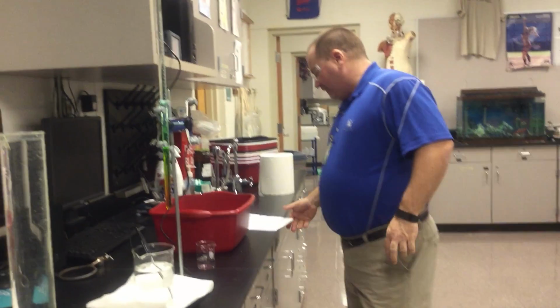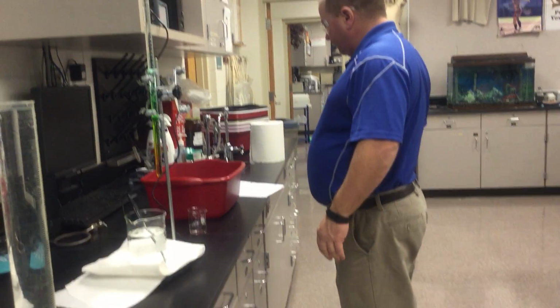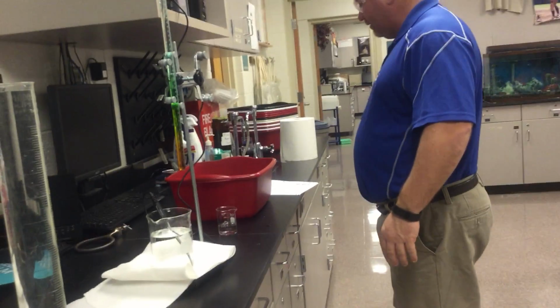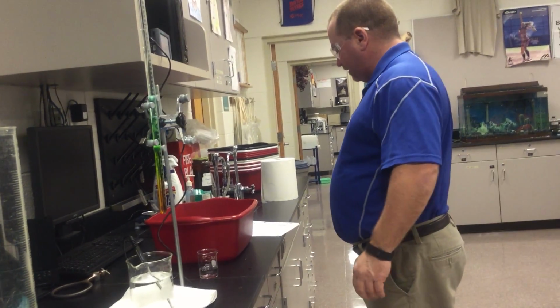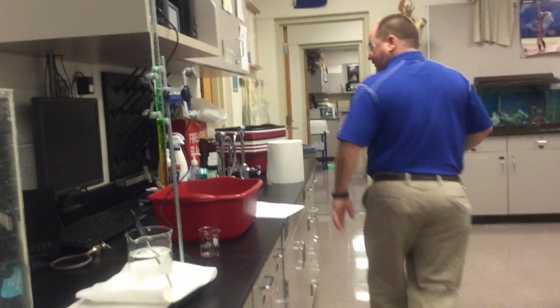Okay, after I've done that, it says lower the magnesium coil into the water to a depth of about 5 centimeters. Use a one-hole stopper to hold the string in position as in figure 1. The stopper should displace some water from the liquid.